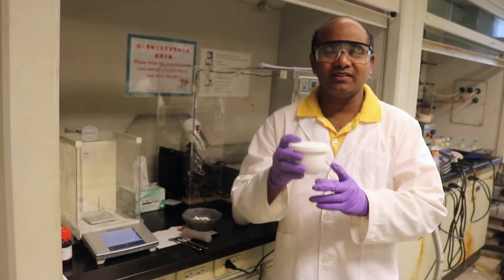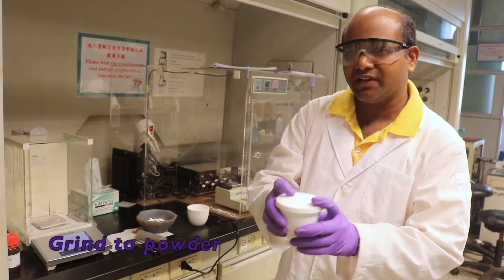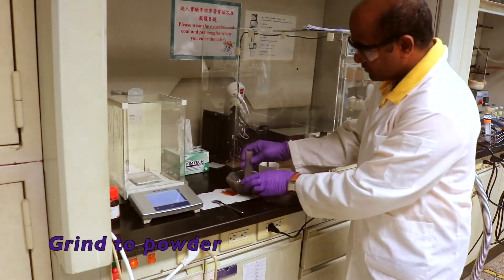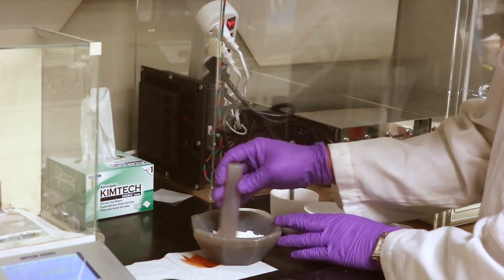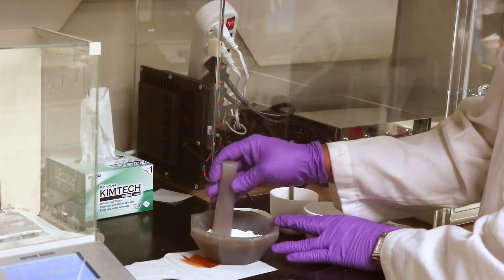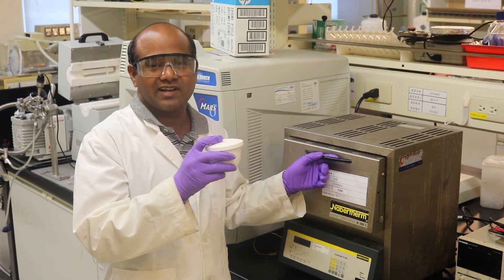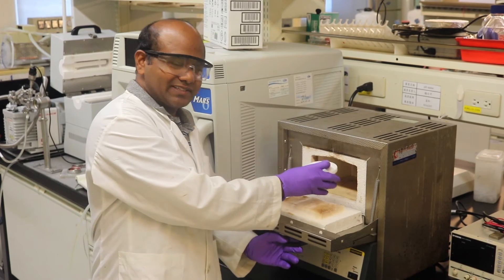After ball milling, we get the dried compound, and this dry compound is ground in a mortar and pestle. The powder is then calcinated at 900 degrees centigrade for 12 hours in the furnace.